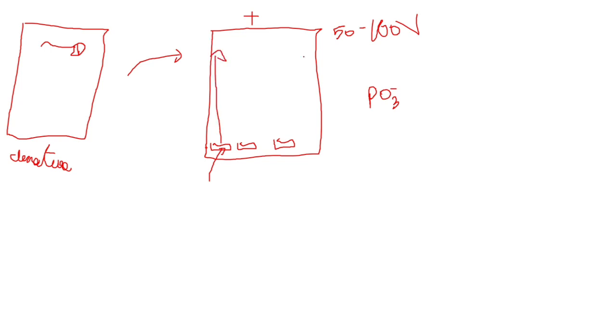We know that agarose gel has some minute pores through which the DNA and RNA move. If the RNA molecules are smaller, they will be able to move through the pores easily. If the RNA molecules are bigger, it will be a bit difficult for them to move through these smaller pores.